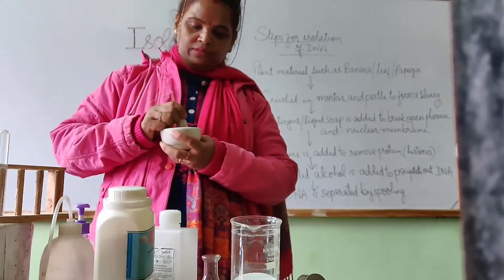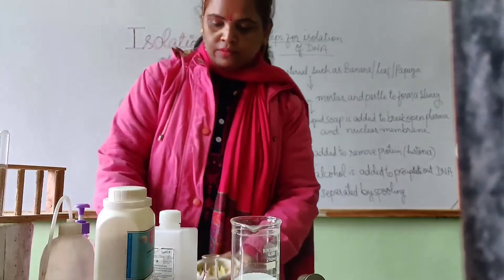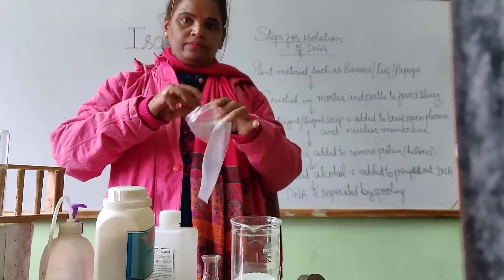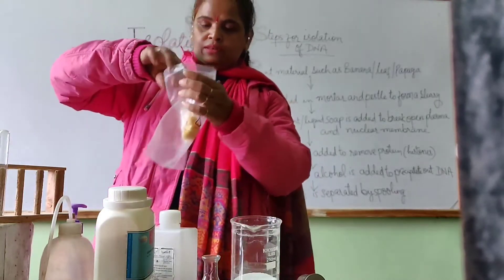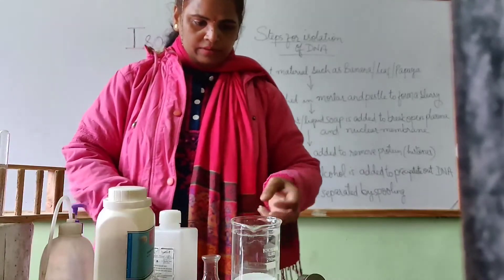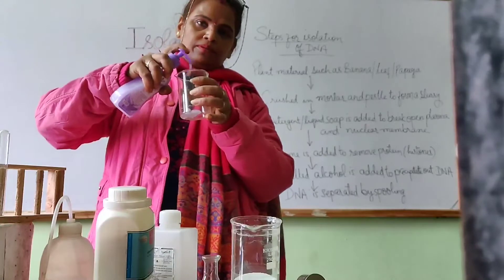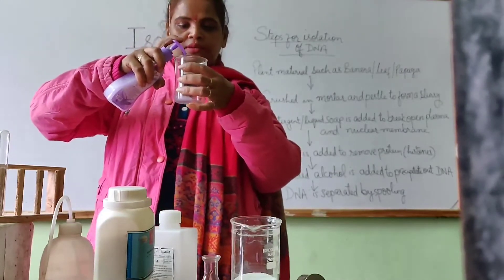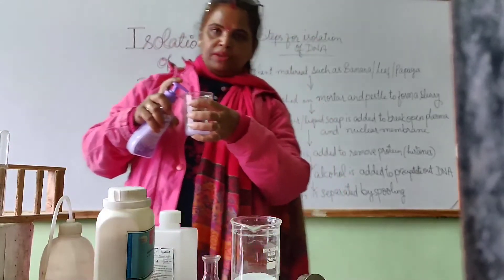After that, we will crush it. After crushing this banana, we will take a polythene bag and put this banana in it. It will break the cell membrane.